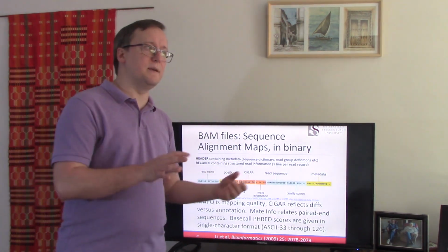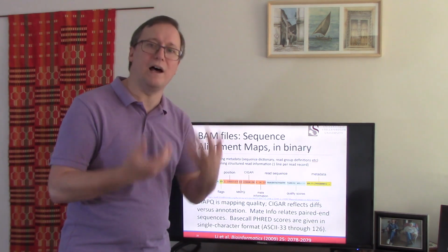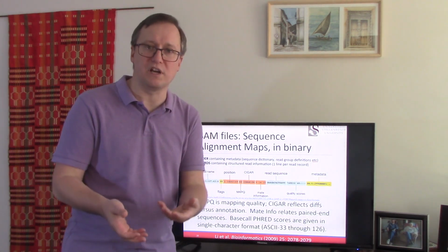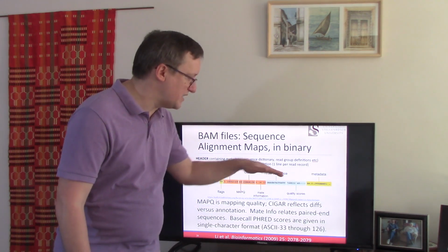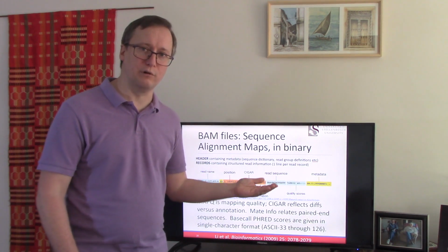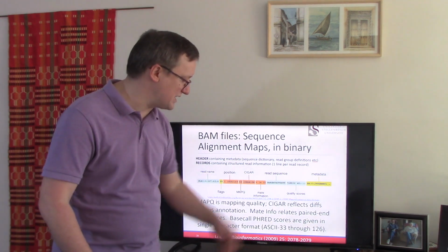So a SAM file is not all that easy to read by eye, but it is intended to make it possible for you, for example, to grep through for the name of a particular read to ask where it's been annotated. So the SAM format is texty enough, you can get at that. Generally speaking, SAM and BAM files are for reading by other software these days. But initially, at least, that was a little different.